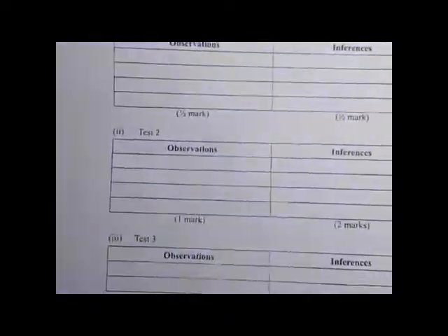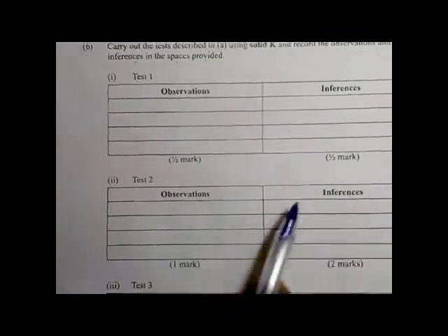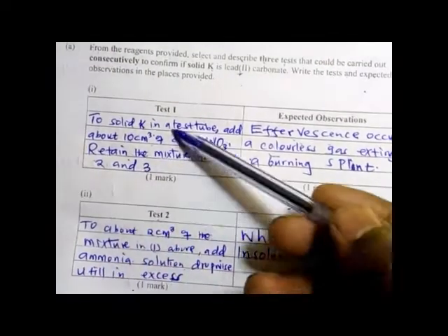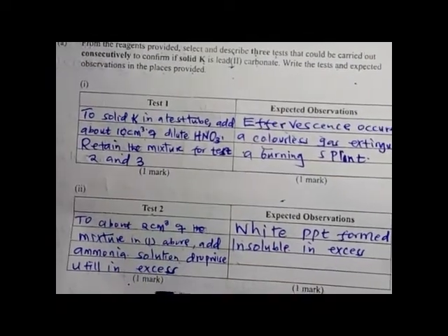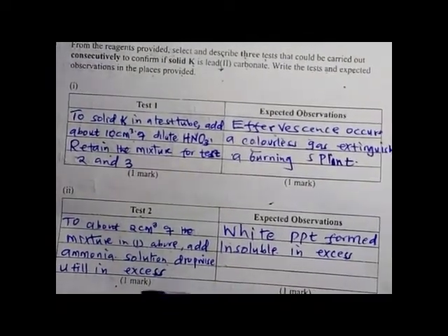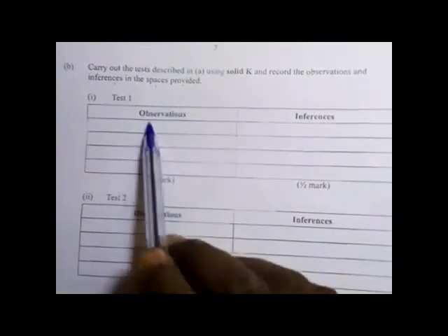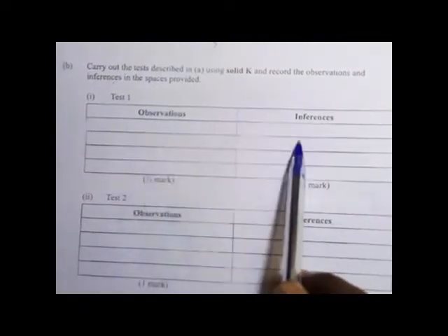So here they were supposed to carry out this now practically. Remember, the earlier part was just being written, showing the understanding you have of these things. But here they were supposed to do it, and then state the observation and then the inferences.